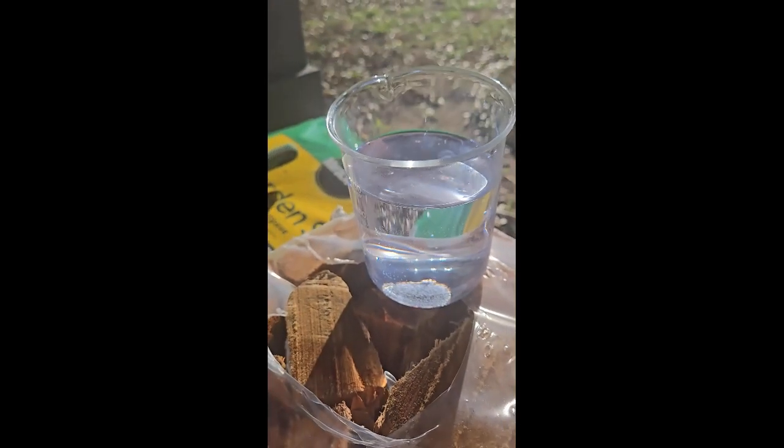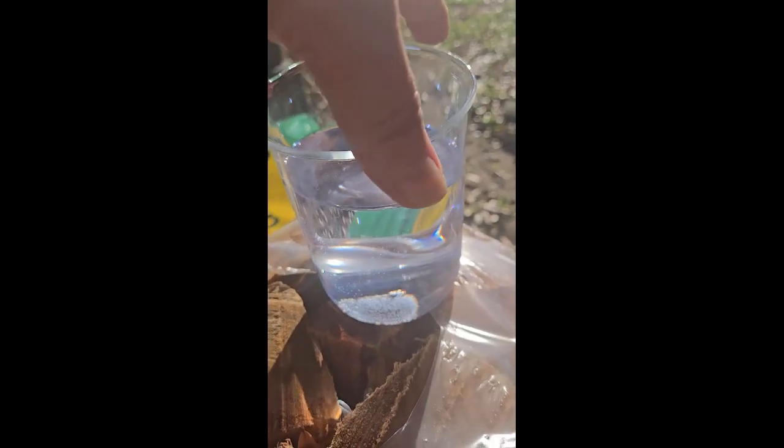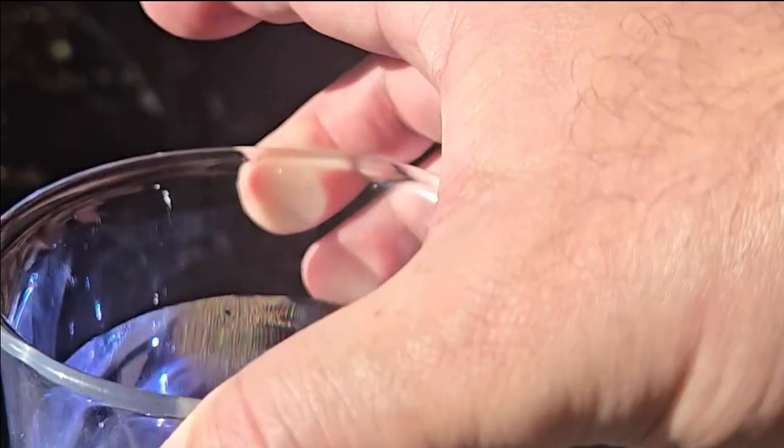So I took the beaker outside into direct sunlight, and as you can see, the solution's gone colorless, and this is due to the formation of the leucothionin.